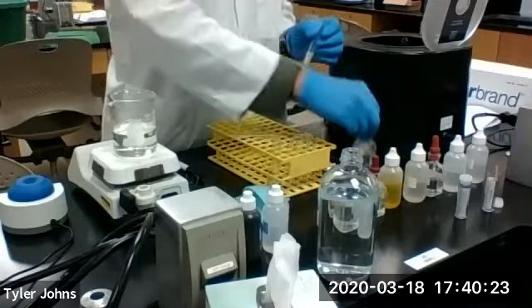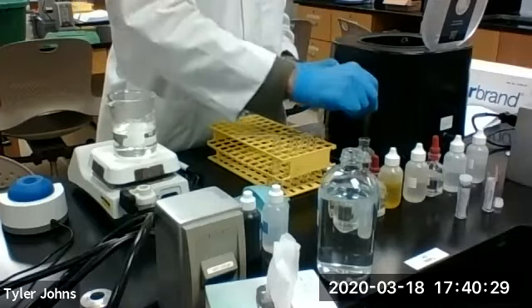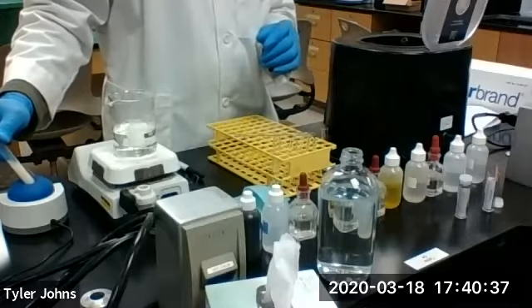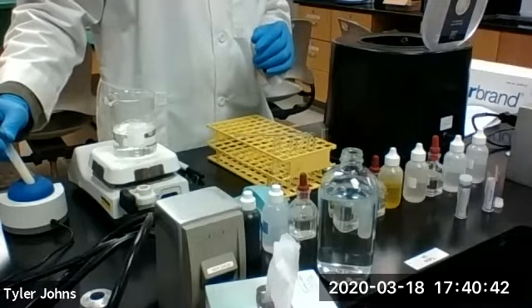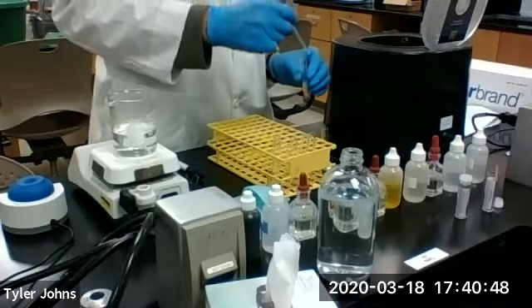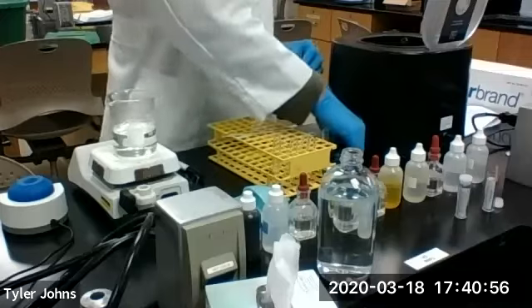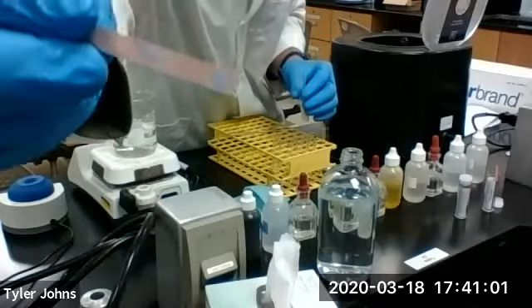Need a little bit more ammonia. As you can see, we're back to basic by the addition of the ammonia.